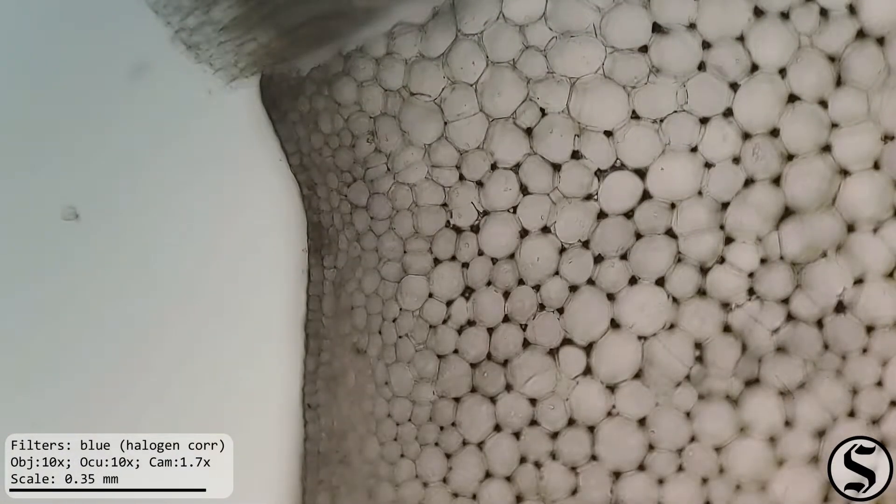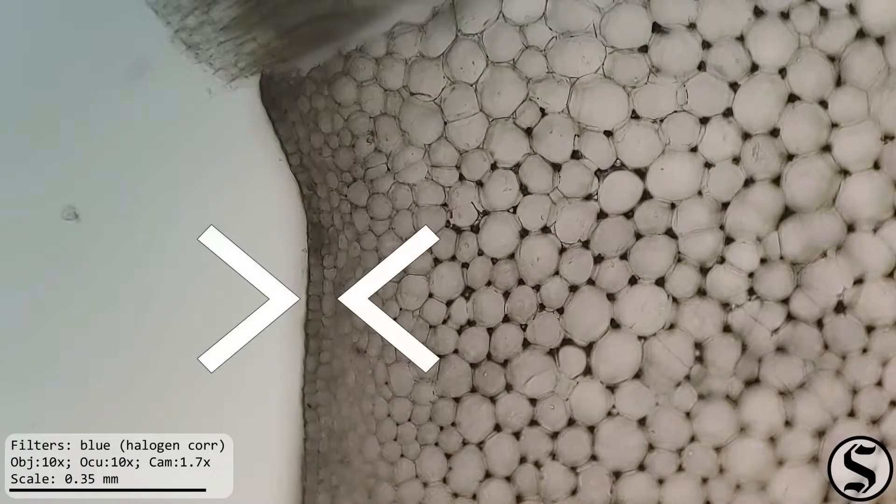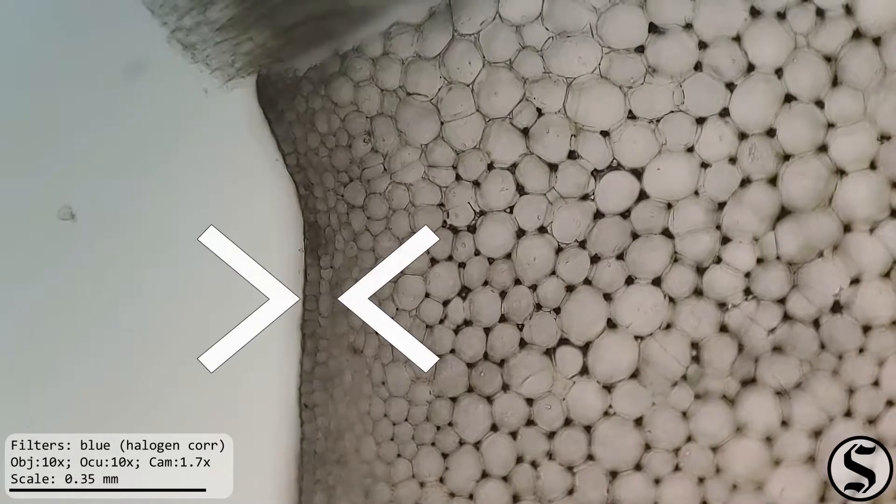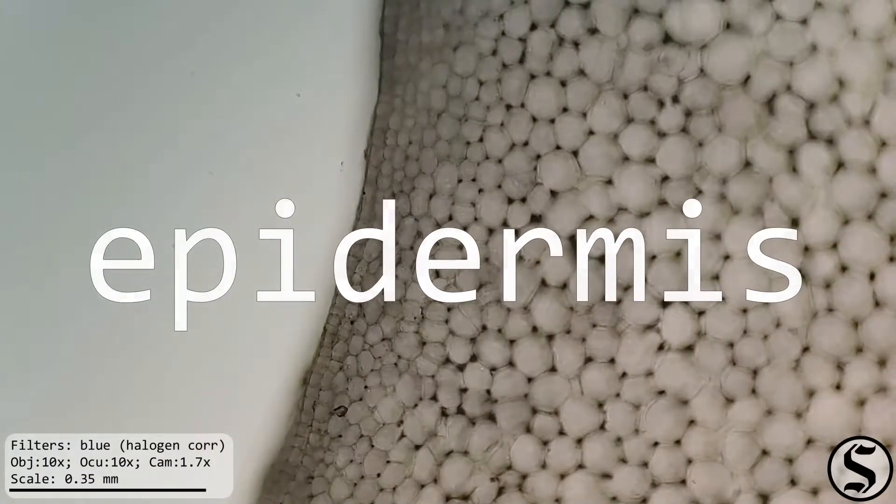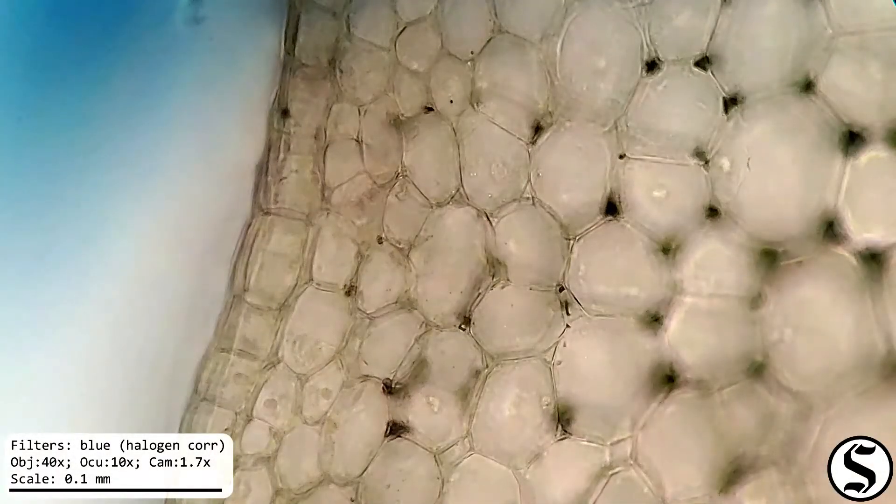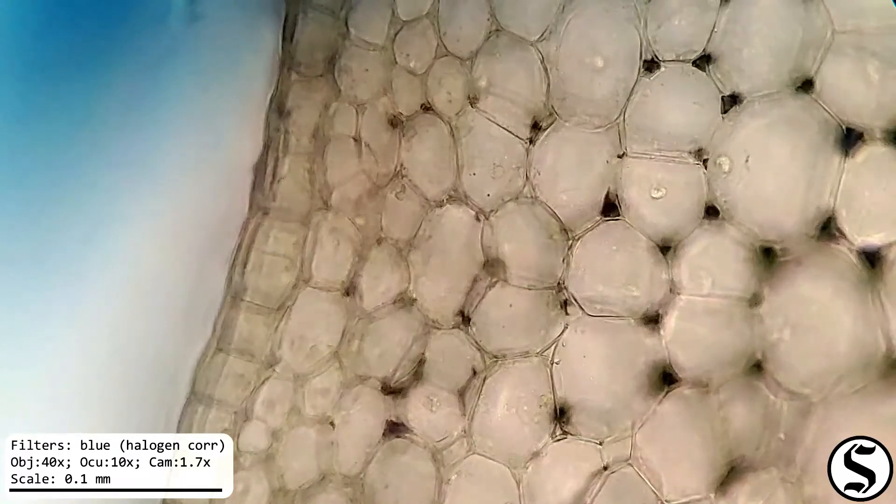Under slightly higher magnification we can see that there's a very distinct row of cells on the outside and that is the epidermis. That's Greek for epi on top of and derma skin because it's the outer skin layer.